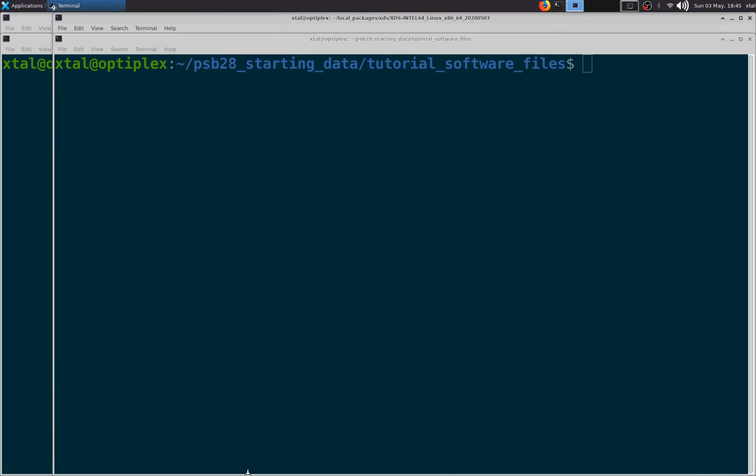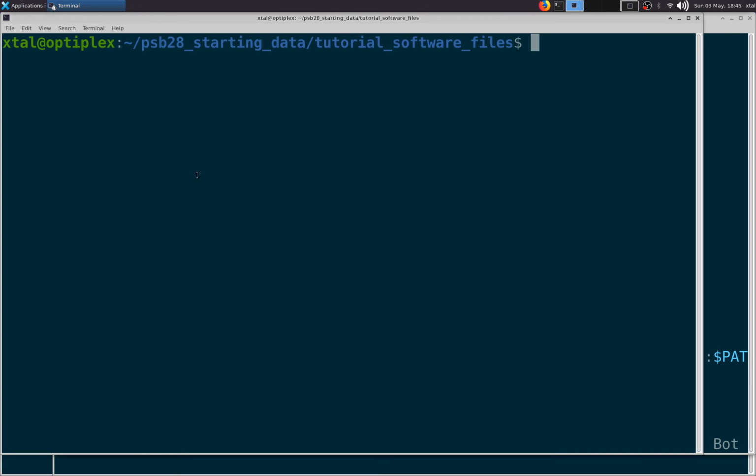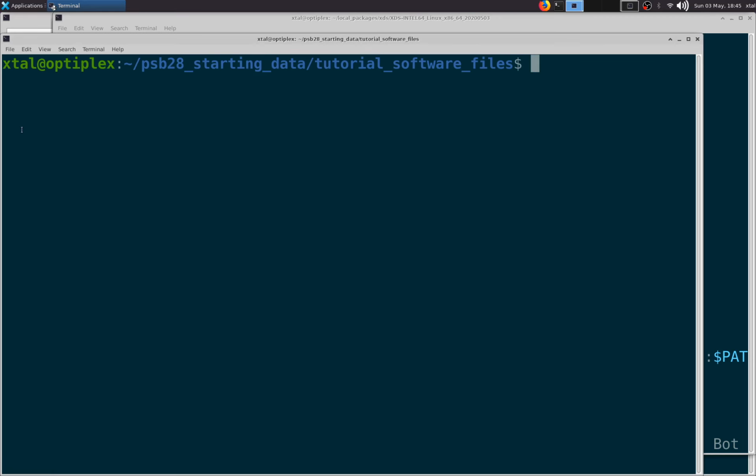Let's see if those have finished. I open lots of terminals. My cat sat on the keyboard.